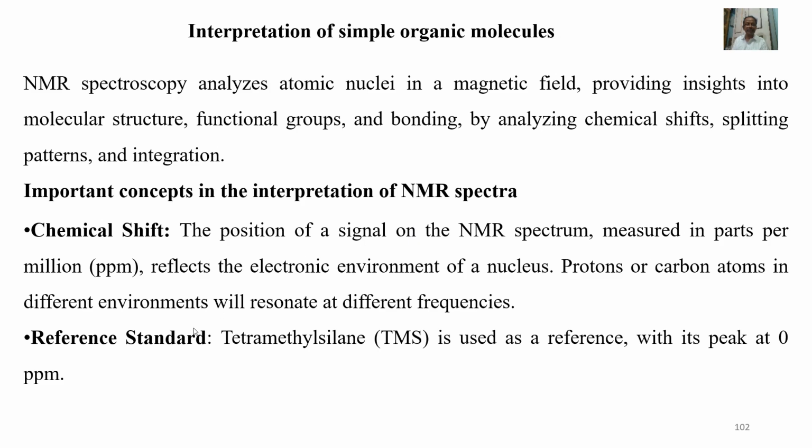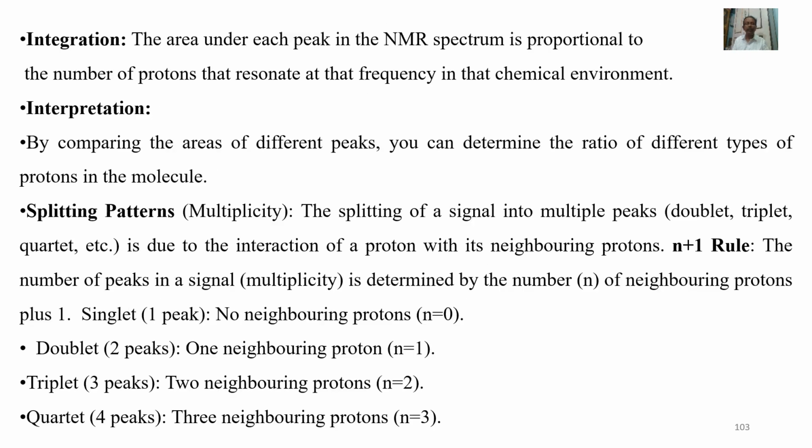Reference standard. Tetramethylsilane is used as a reference with its peak at 0 ppm. Integration. The area under each peak in the NMR spectrum is proportional to the number of protons that resonate at that frequency in that chemical environment.